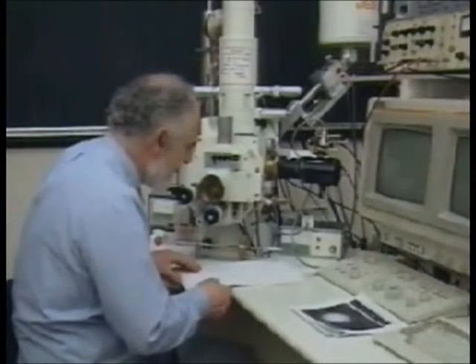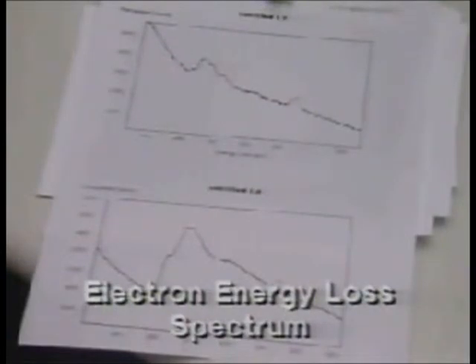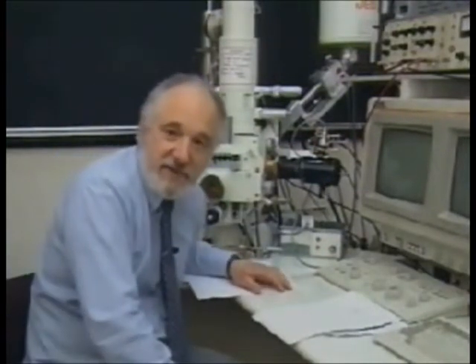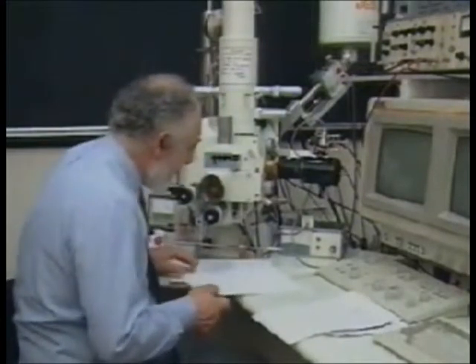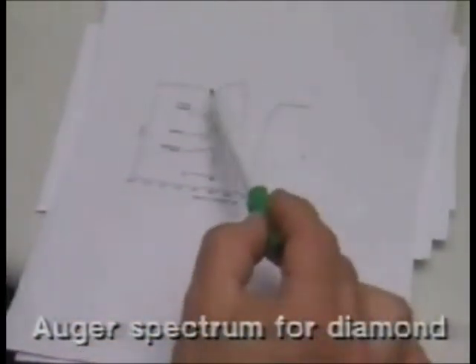Moving on to the spectroscopies, this is an electron energy loss spectrum, and one expects to see, if it is a diamond film, a peak in the spectrum rising at just 290 eV, that's the energy loss, and it will have 3 characteristic peaks in that spectrum, and that is a fingerprint of a diamond film. Now, we didn't find that everywhere in the film, but it was conclusive evidence that one does have diamond within the film.